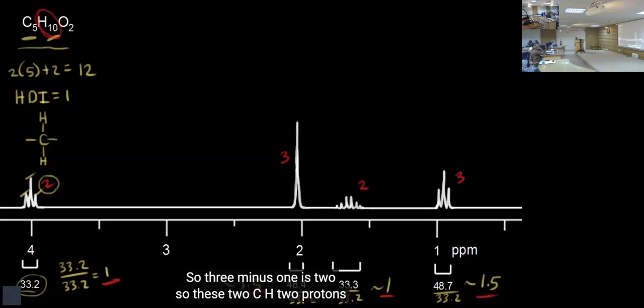Oxygen has a lone pair of electrons, so you are going to observe both effects, electronegativity and the lone pair. And when you have the carbonyl directly attached to CH3, then it's more like an electron withdrawing effect because of the carbonyl. Okay, so we'll play the video now and see what they come up with.